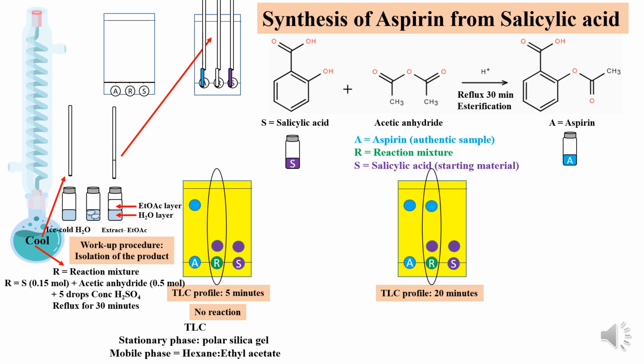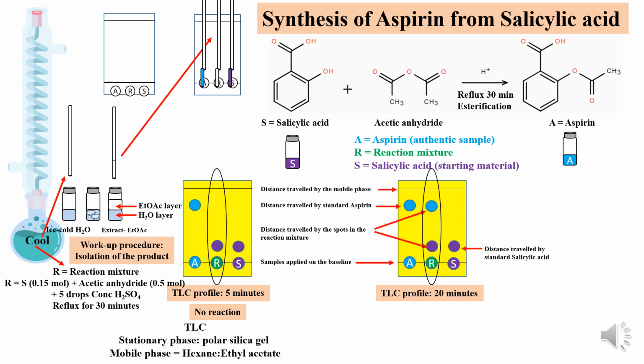One spot for the starting material salicylic acid and another possible spot which could be that of aspirin. So there is still unreacted salicylic acid present in the reaction mixture. So we can conclude that it is an incomplete reaction.